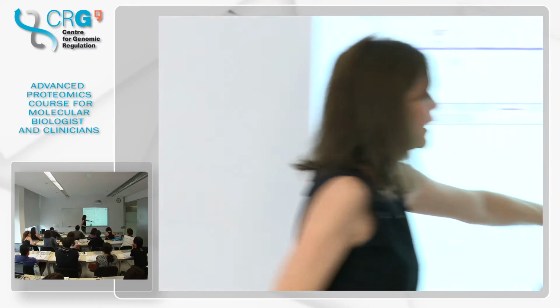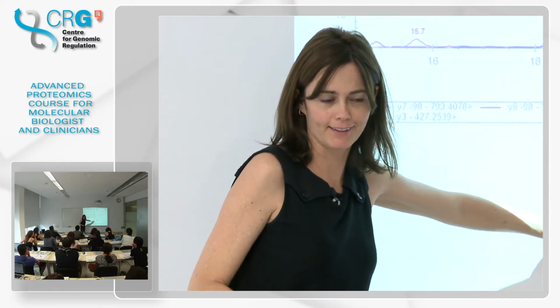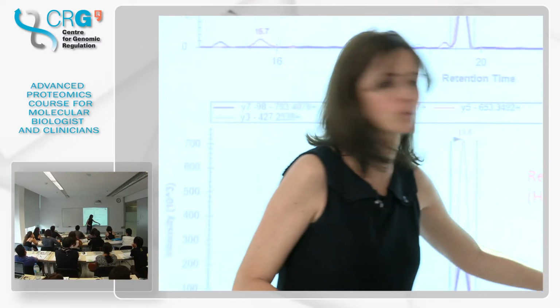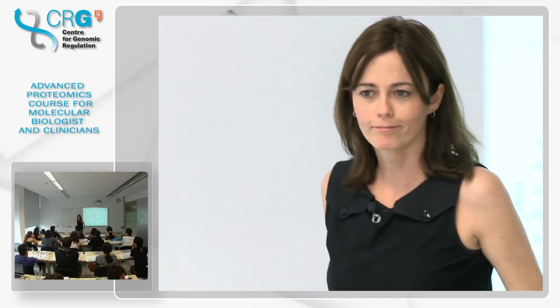This is real data, but the thing is that when you have your heavy peptide, you run it in different concentrations and you see how this signal gets more or less intense, while this one probably is going to remain the same. So with the heavy peptides, you can really be certain.